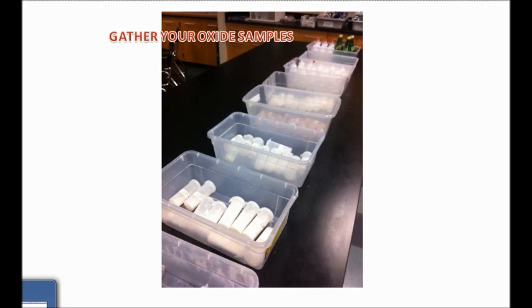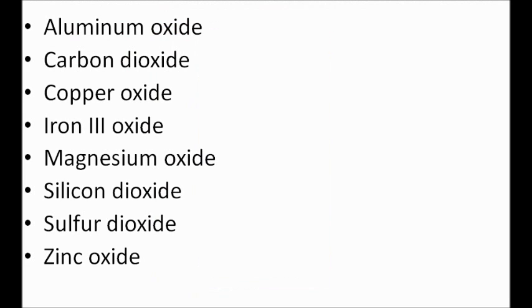I want you to take your oxide samples from the center demo table. There are 8 samples. These samples are aluminum oxide, carbon dioxide, copper oxide, iron oxide, etc. And of the 8 samples, the only one that is in liquid form already is the carbon dioxide. We're going to be using Perrier water. So you only need a small sample of that to place inside your test tube and do the pH test in.